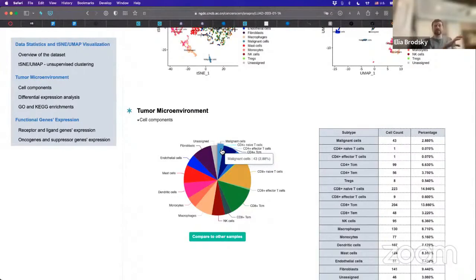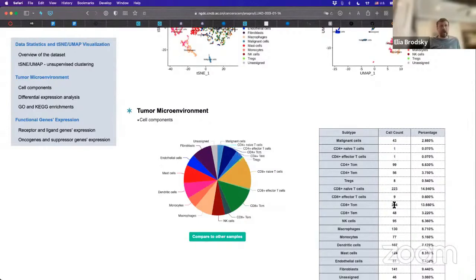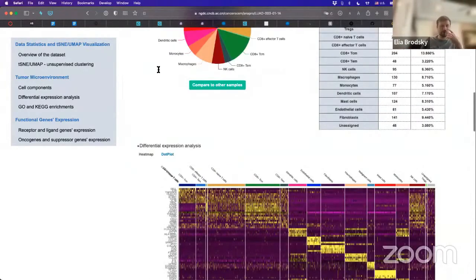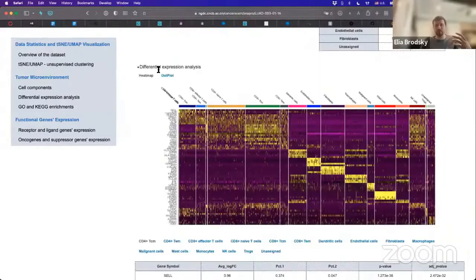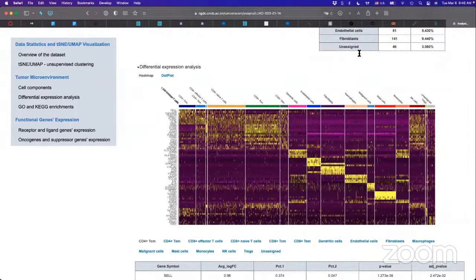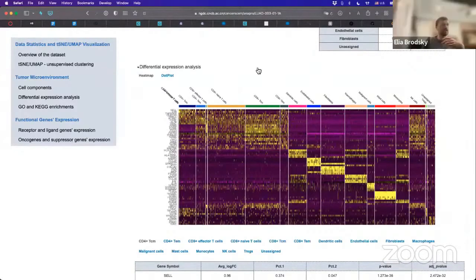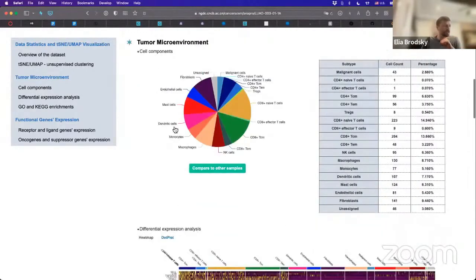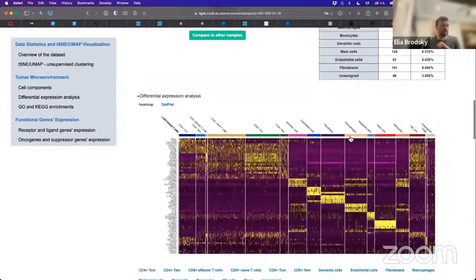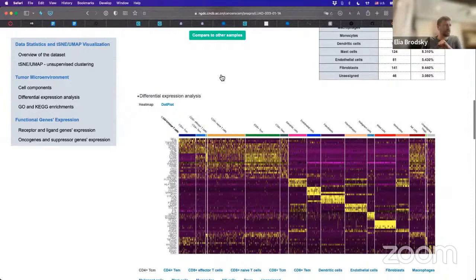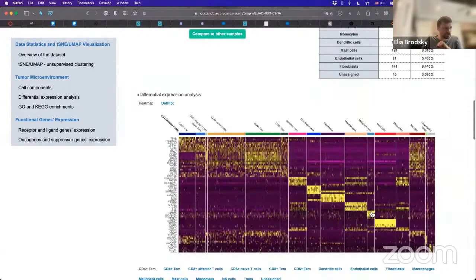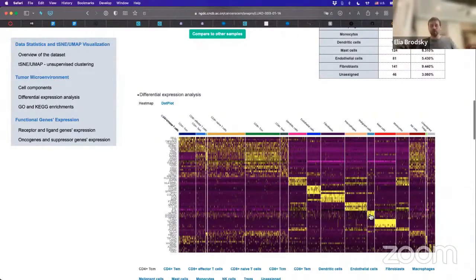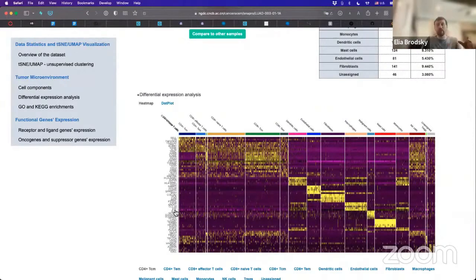If you think about cancer and the stages of cancer, it's all about this proliferation and going beyond the boundary. Containing the tumor in a well-defined boundary is stage one. And as it goes beyond that boundary, that's when your stages continue, and eventually metastasis is that they're way beyond the actual environment. This is the problem right here, these malignant cells. Now you can see here, this is just counts of cells. If you scroll down, this is now differential gene expression. So now we would like to ask, what are the differentially expressed genes in these different clusters? These are the different clusters, and let us try to compare them and identify differences between the clusters.